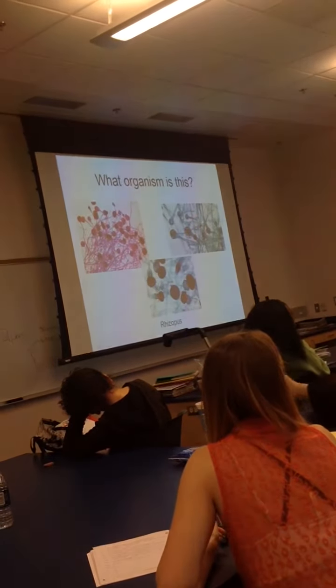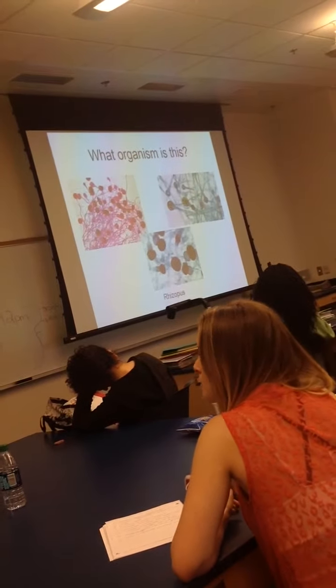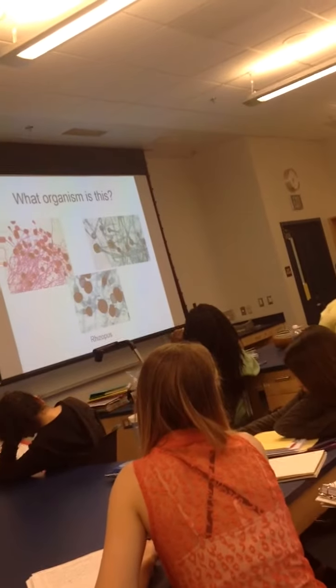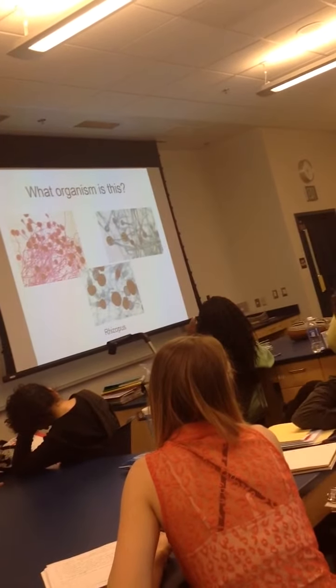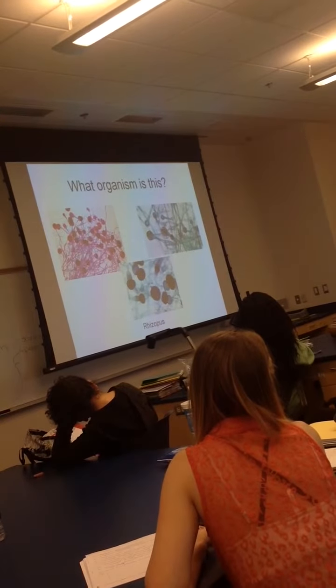Did I say black mold? I'm sorry, yeah, bread. You said black. Okay, that's fine. Black bread mold. It's also the one that you have in that little test tube on the microscope. But this is the slide version of it. Okay, so this is Rhizopus.